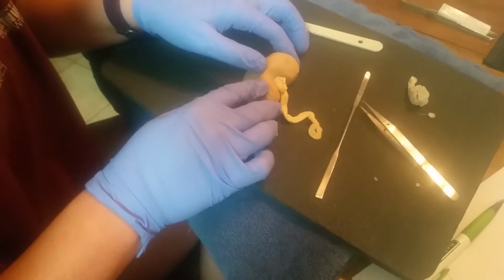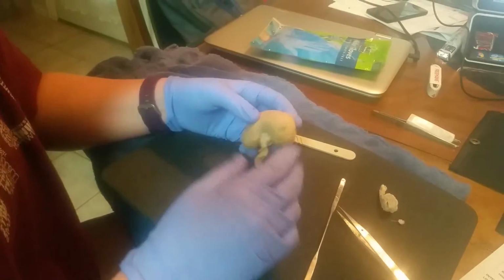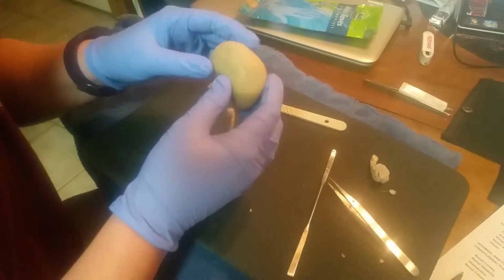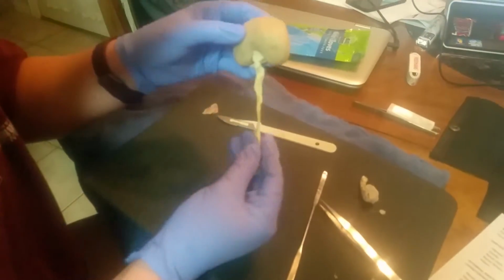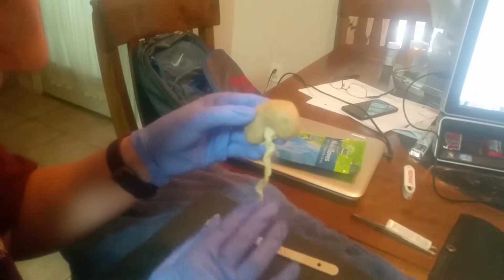Alright, so today we're going to talk about our sheep kidney for our dissection. Starting off with our surface area anatomy, the outer area of the kidney is our fibrous capsule. It protects the kidney from everything around it. This structure right here is the ureter, that long little string-like area.